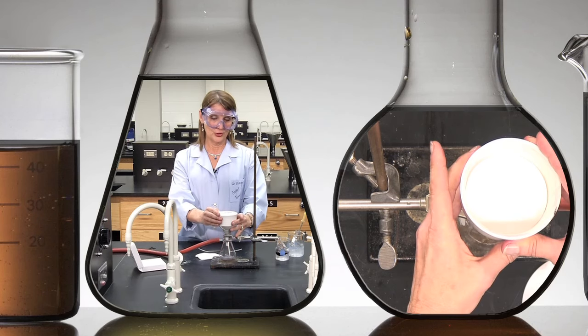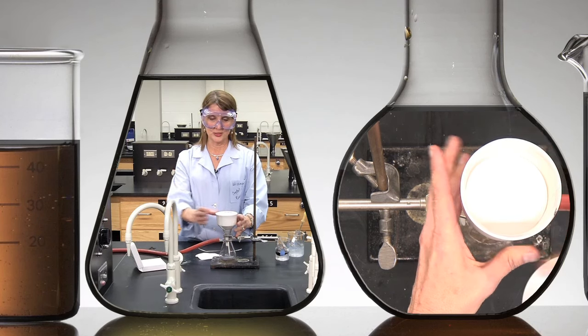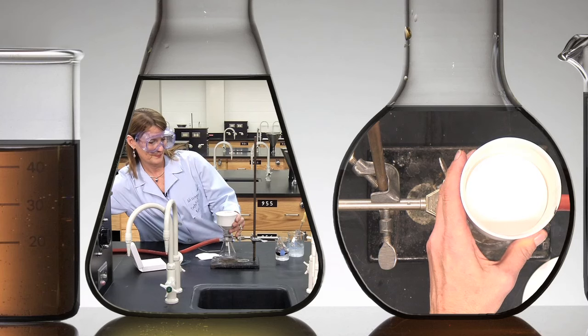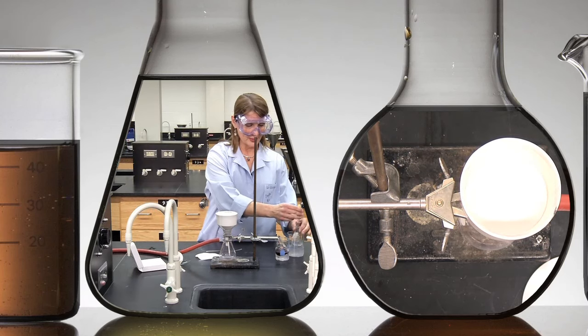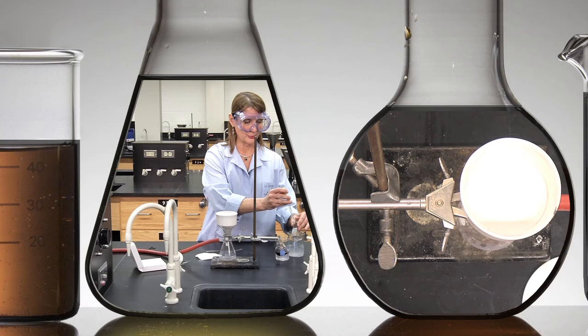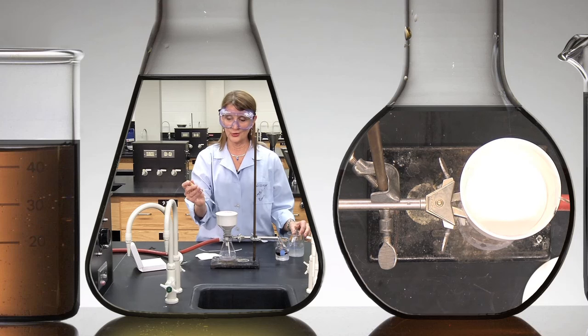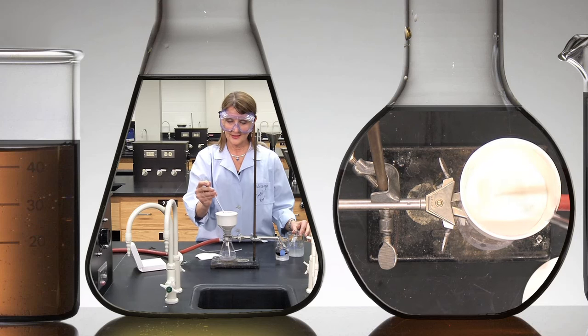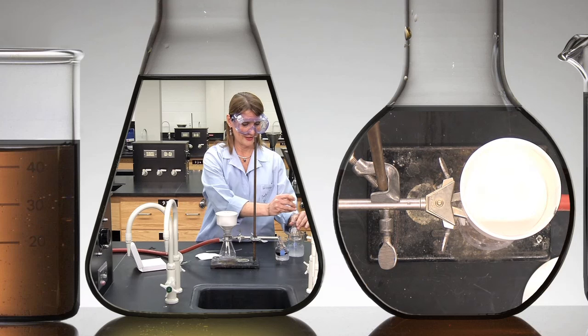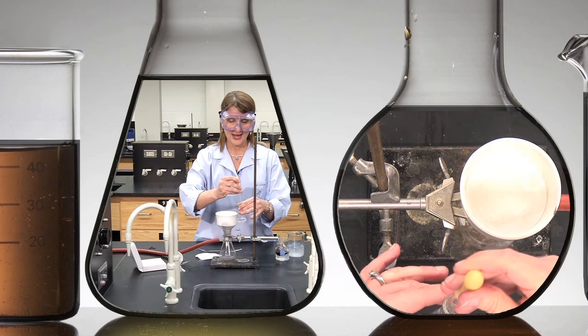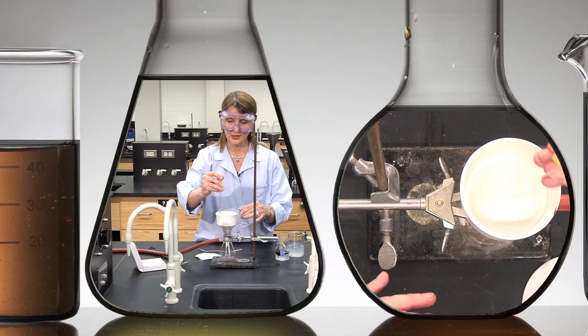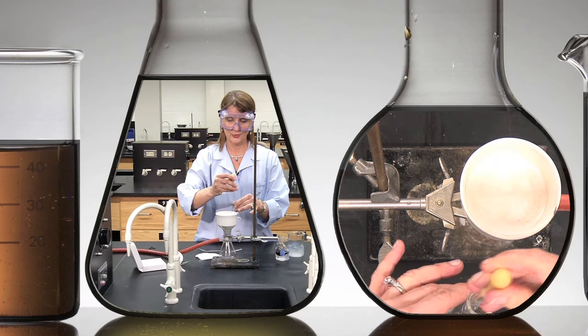In order to start the vacuum filtration, we turn on the vacuum, which you can hear, and then you want to moisten the filter paper with a little bit of a cold solvent that your crystals are not soluble in. This makes sure that the filter paper is adhered tightly and the filter crystals will not go under the filter paper when you filter.